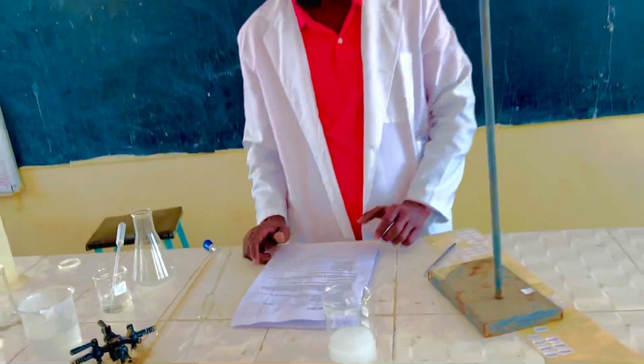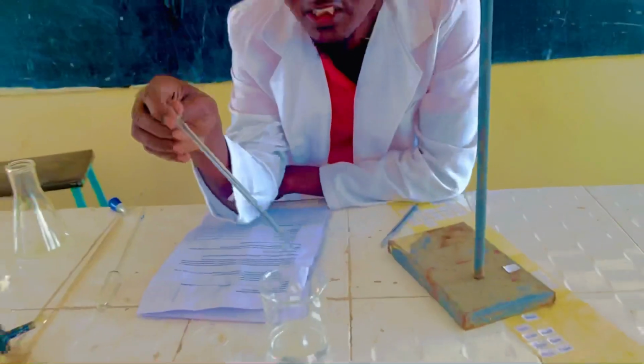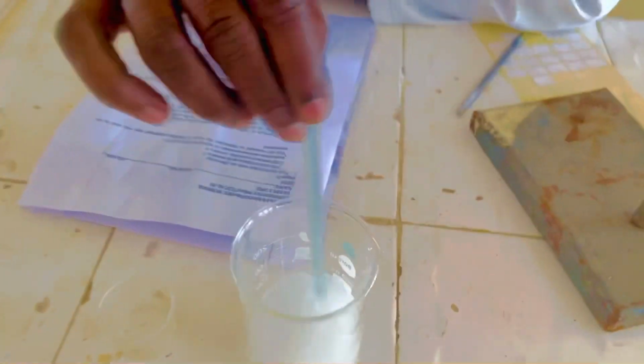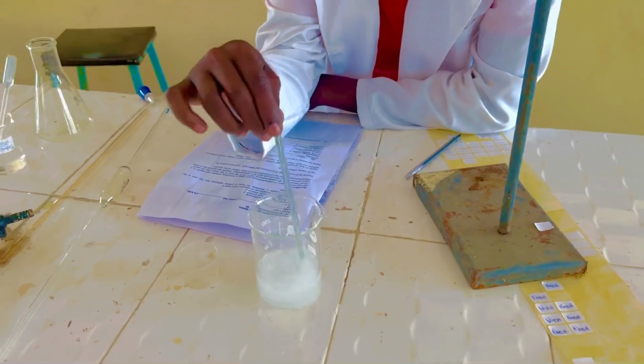Now stir gently using a glass rod. So stirring is done.